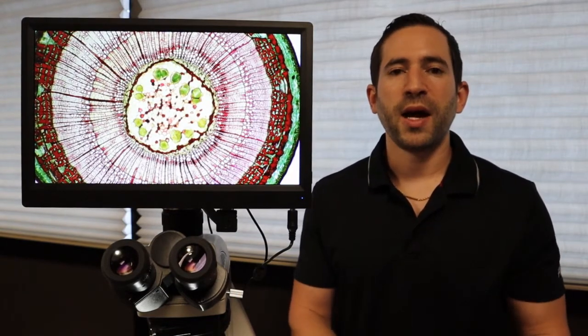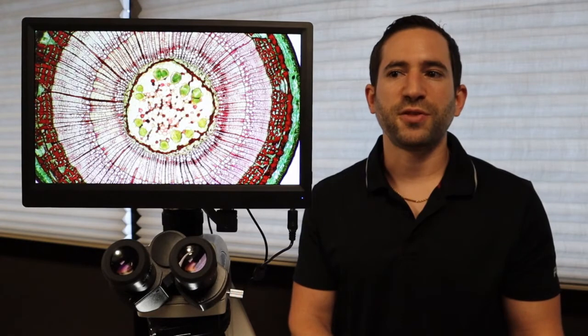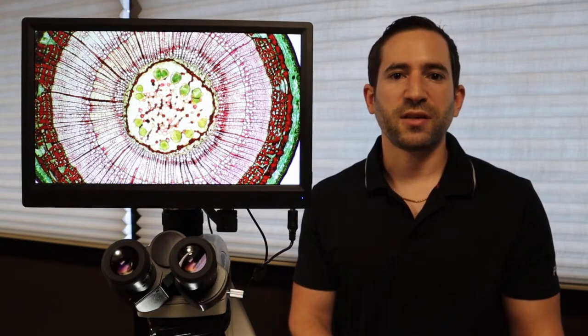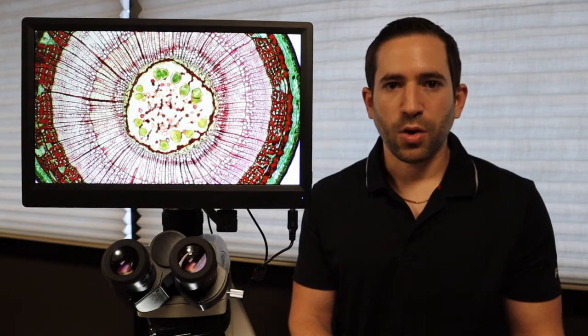We can add an LCD screen to almost any microscope and there are lots of options with different features and functions such as basic display, USB and HDMI, or USB, HDMI, and Wi-Fi.